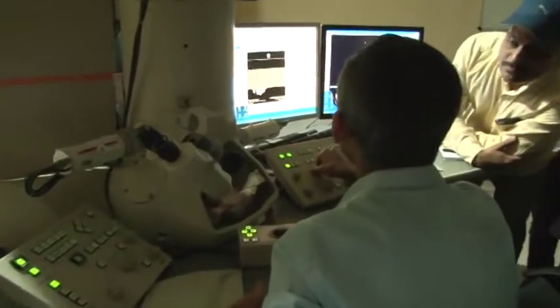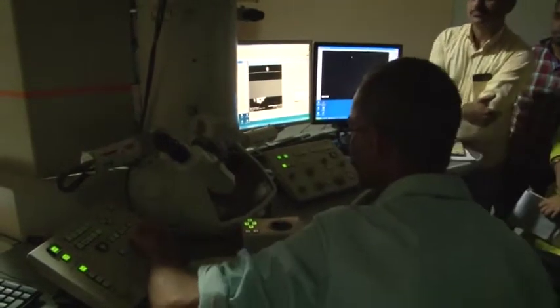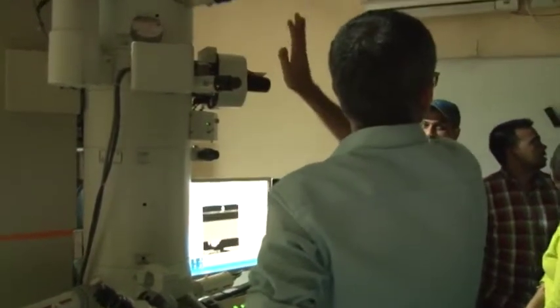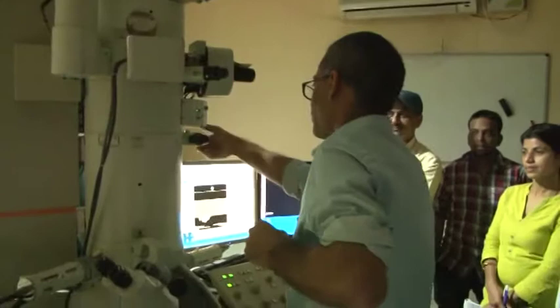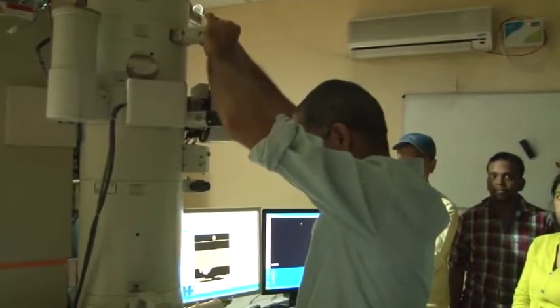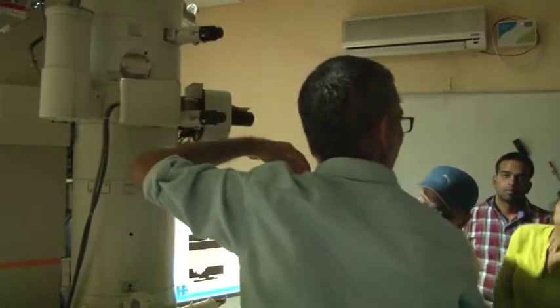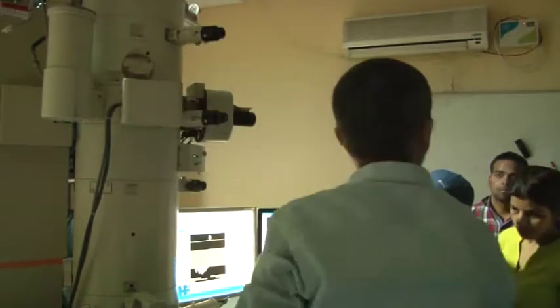Let us reduce the magnification. So I hope that the beam is still there. No, it is still there. Yes, just the upper one, sir. Yeah, this is the upper one. I just checked if this was right, so I just want to be sure. So let us try to get it. Yeah, so now you see it is there, but if I had done it a little more... one shouldn't do it too much also, I think. So anyway, I stay like this, okay?